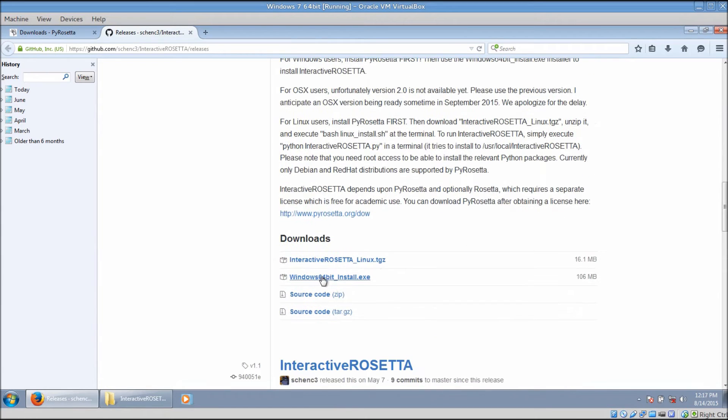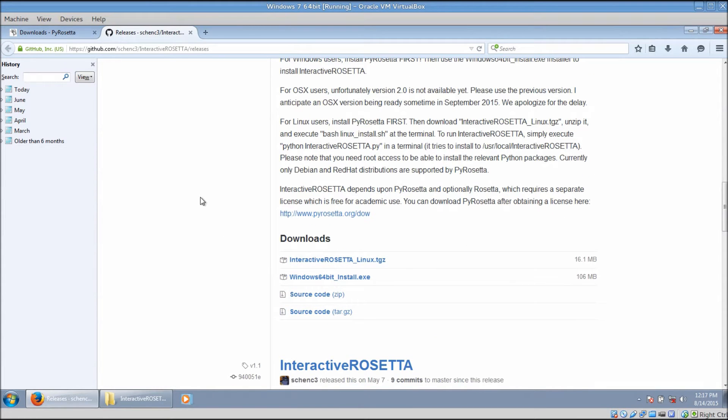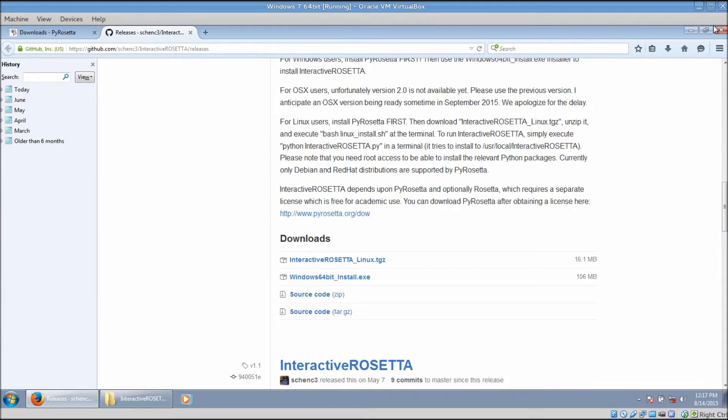Scroll down to find the files for various operating systems and download the Windows version. This software is free for all use, so all you have to do is accept the GNU General Public License when you install it.